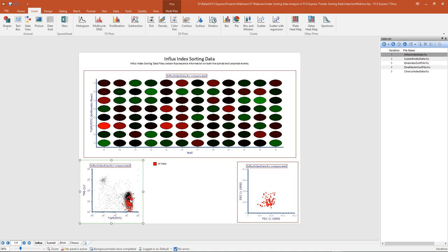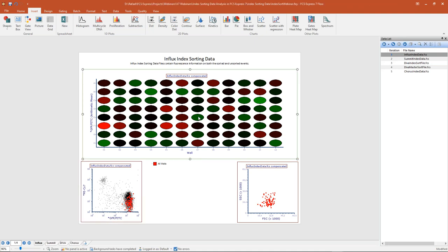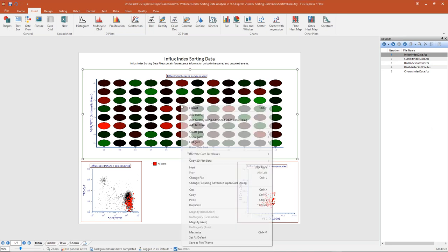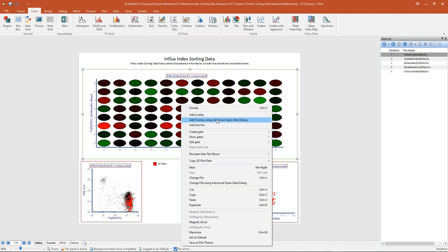In addition to gating on populations, we can also format our heat map to show additional parameters or statistics using overlays and the well radius statistic. Overlays allow us to show multiple files on the same plot. With our heat maps, the overlays will be shown for each well like slices of a pie — in total, on any one well we can have up to five different statistics shown as five different pie slices. We can also assign a statistic to represent the size of the overall well — the well radius statistic.